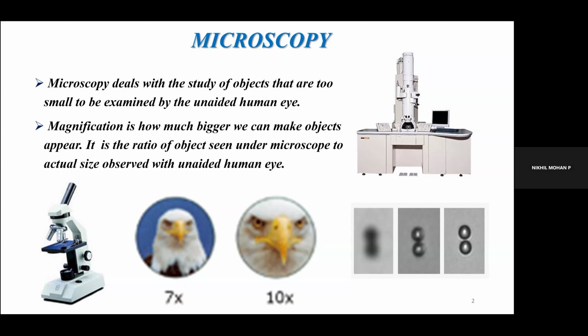If we over magnify, we cannot get any information. If it is very low, then also we will not get any information in the microscope's image. So magnification is very important. Next thing is resolution. So what is resolution? Any idea? Because in our mobile phone cameras, we say high resolution, and it's like megapixel, gigapixel like that. Okay. So what is meant by resolution? So we can define it.